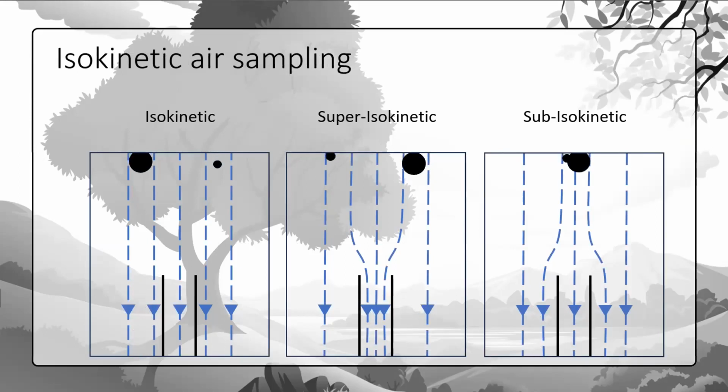If you collect faster or slower than your environment, then you start to make some kind of strange collecting, separating your entire situation so that you collect, for instance, always the small particles with low inertia forces. They will be highly influenced by your different collecting speed, and therefore you can't tell anymore that the amount of spores is representative of the environment at the time that you collected.